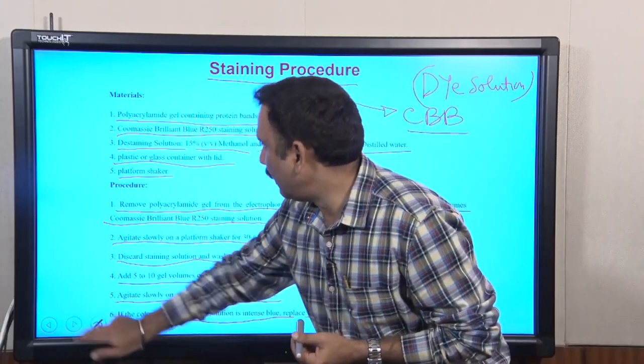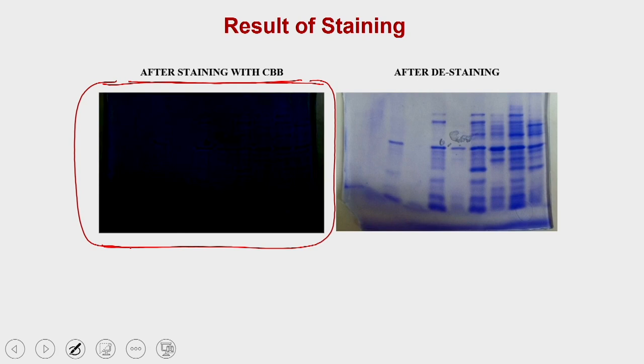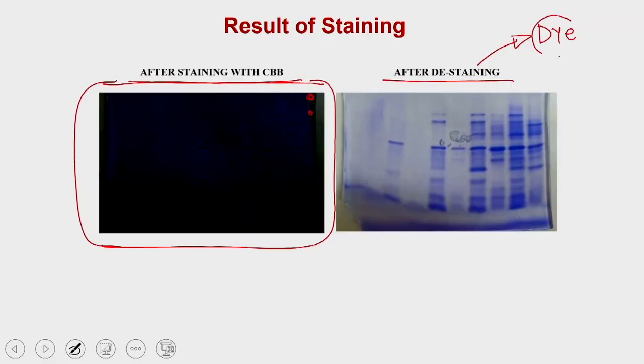Once you stain with Coomassie Brilliant Blue, you will see that your gel is converted into a dark blue film. But once you do the destaining, since the dye is non-specific, it absorbs everywhere onto your gel, and this absorption is very weak compared to its binding with the protein molecule. So when you put the gel into the destaining solution, it starts removing the dye from the gel block, but it will not remove the dye from the places where the protein is present, because the affinity of the dye for the protein is more than its affinity for the gel monomers or polyacrylamide monomers. As a result, when you destain, the dye present in the gel comes out, and you will see a pattern.